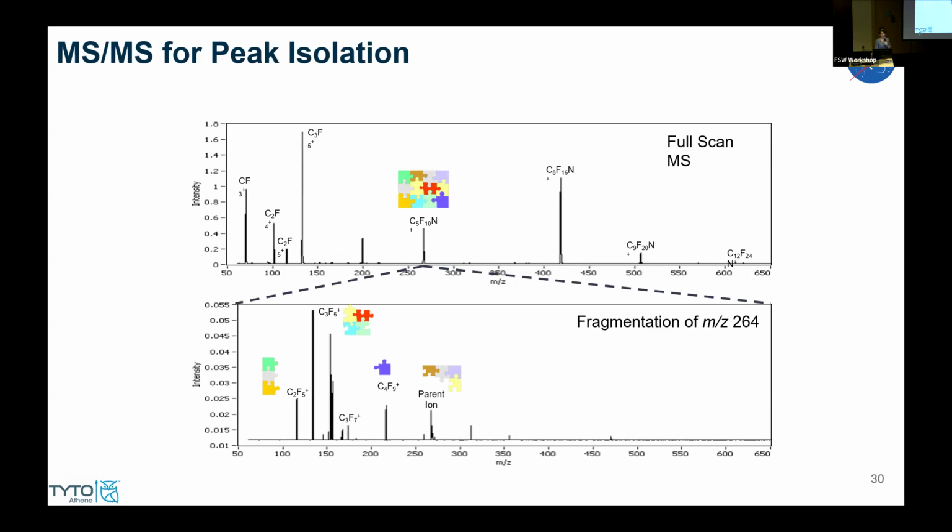On Titan, we cannot do that, and it is one requirement to have this MSMS automation on board Dragonfly mass spectrometer to be able to have this whole process of selecting the peak and then fragmenting it more autonomously.